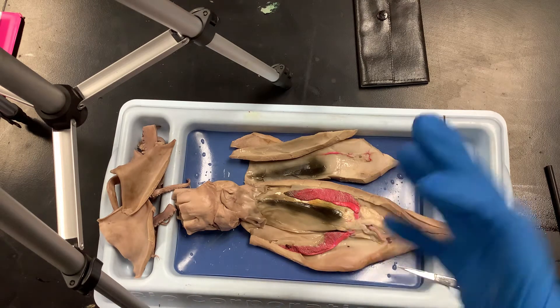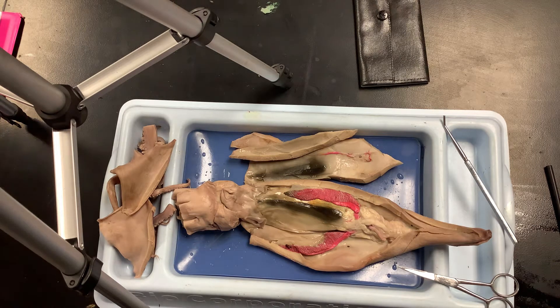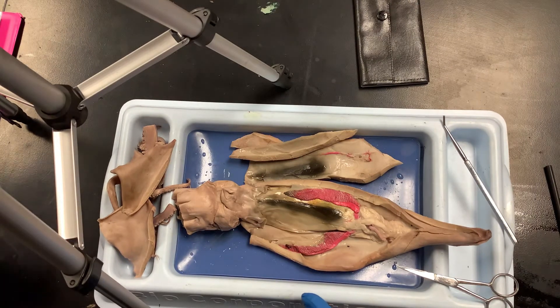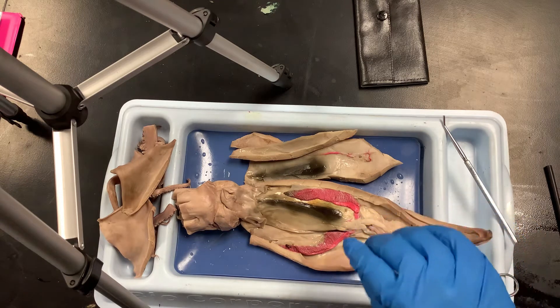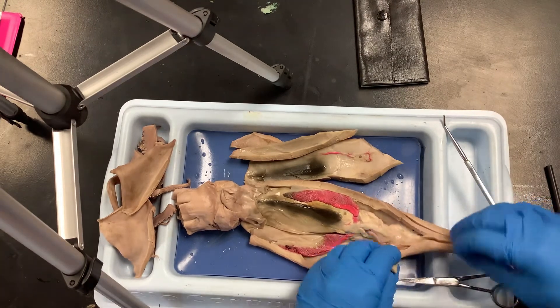While you're waiting for classmates to get to this point, look at your concise diagram — the inside portion of it. You can try to determine if you have a male or a female. The male has this structure here, and the female looks like this — sometimes we get lucky and find eggs. This is definitely a male. We very rarely get females, so I don't think anybody in this group has eggs.